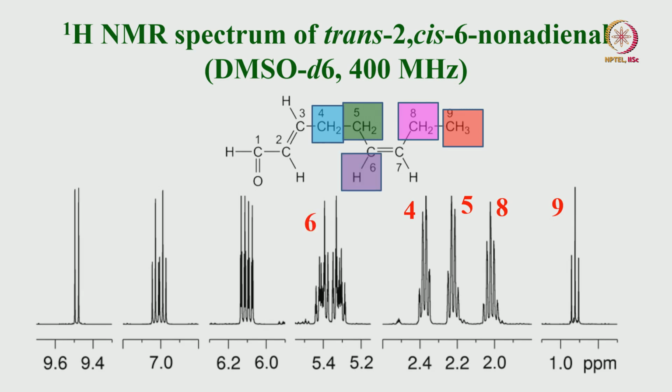So, I would say that, and this is proton 6. Obviously, I told you it is complex. Similarly, this is 7, even that is also complex. Then what is left with you? What is left is this CH proton. This CH proton, proton 3, can experience coupling with this, can experience coupling with this, and experience coupling with this. That is very interesting.